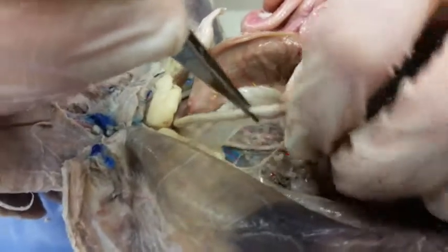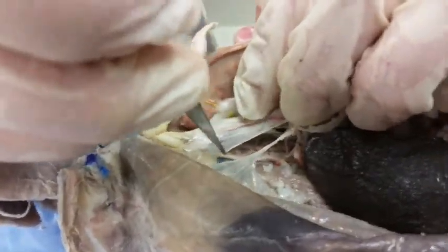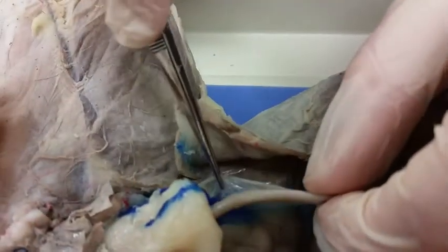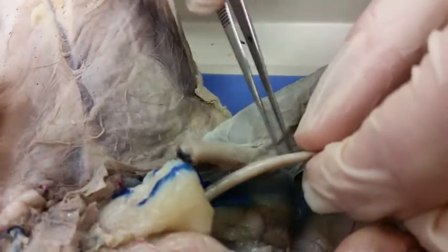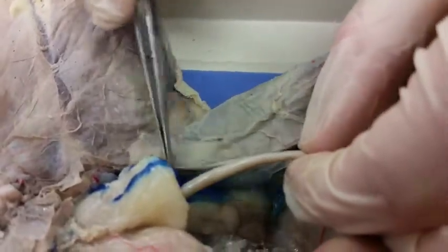Ours kind of got cleared away, but you can see some of the remnants here that didn't get holes poked in it. And then over on the opposite side of the body, preserved very well, we have our round ligament, which is attached to this mesovarium and mesometrium. So mesovarium's up here, mesometrium is back here.